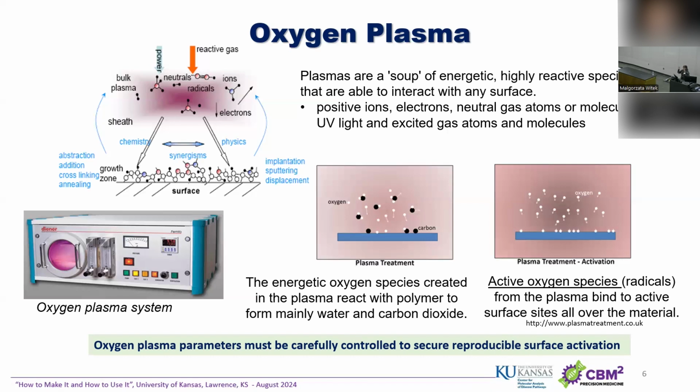Also the position of your substrate from the plasma. So this works, but you have to be really careful. It can sometimes be irreproducible. For example, it's a normal way to oxidize PDMS and glass, for those of you who work with PDMS, and it bonds instantaneously. And sometimes you have your flow conditions of oxygen too high, and you will never bond this. So be aware that it's not a simple procedure to use oxygen plasma. And when you do, you need to report the exact conditions.